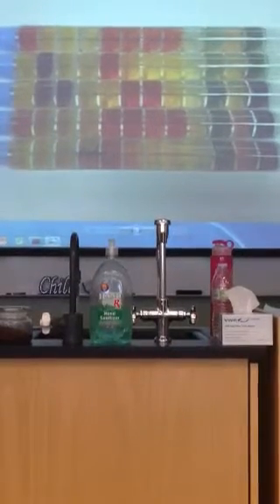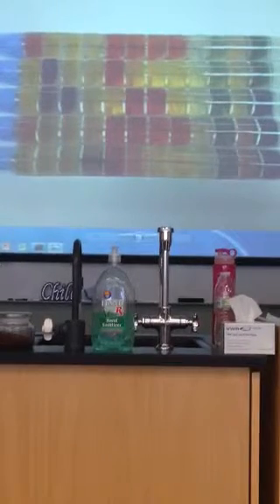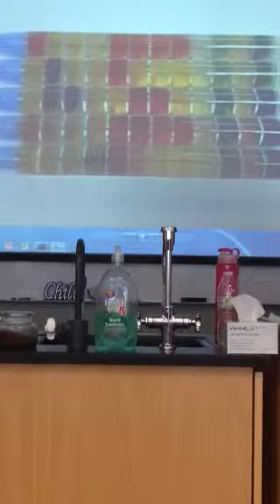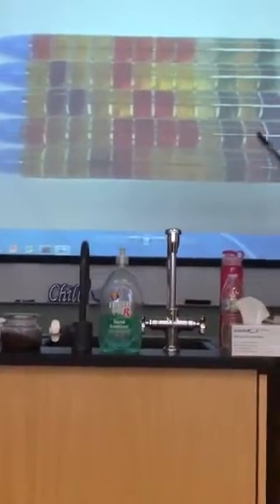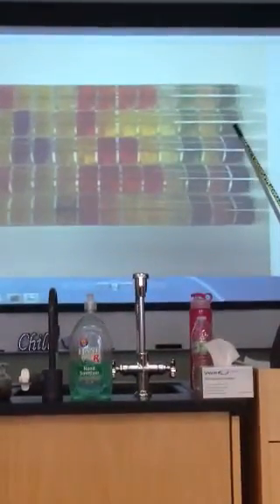Citrate is the same thing as citric acid. Where have you heard citric acid before? Krebs cycle. And what do you need to run your Krebs cycle? Oxygen. Krebs will not run without oxygen. This is an aerobe. Used the oxygen and ran its Krebs cycle. These are facultative anaerobes. He ran his Krebs cycle. He didn't. He did. They're facultative. They can run it or they don't have to run it, right? But if you're a strict aerobe, you have to run it.